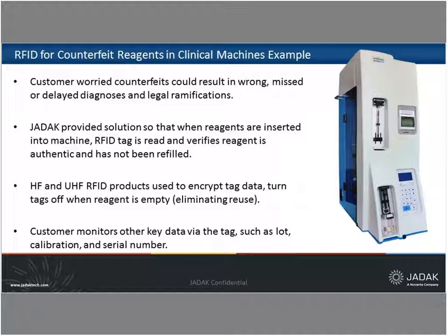The cartridges, mechanically in this case, could be duplicated, but that would be pretty obvious. So it was much easier for the counterfeiters to gather up the used, disposed cartridges and refill them. So with the kill tag feature enabled, the knockoff cartridges definitely wouldn't be recognized by the device and prevented the knockoff reagents potentially from being used improperly in the device.